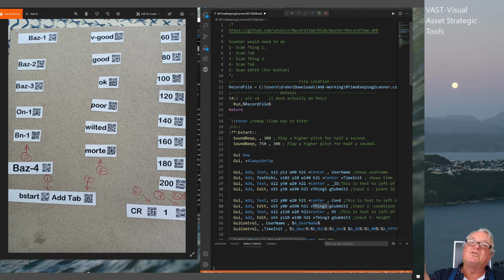So you could do things like, did you give it any fertilizer, and that could be a yes or no. Then you could give a type, and if it's a no, then you just put a blank or something like that, or you just tap through. So there's a whole lot of other things. This was just me needing a few variables to bang in there. That's what you can actually do with this thing here.